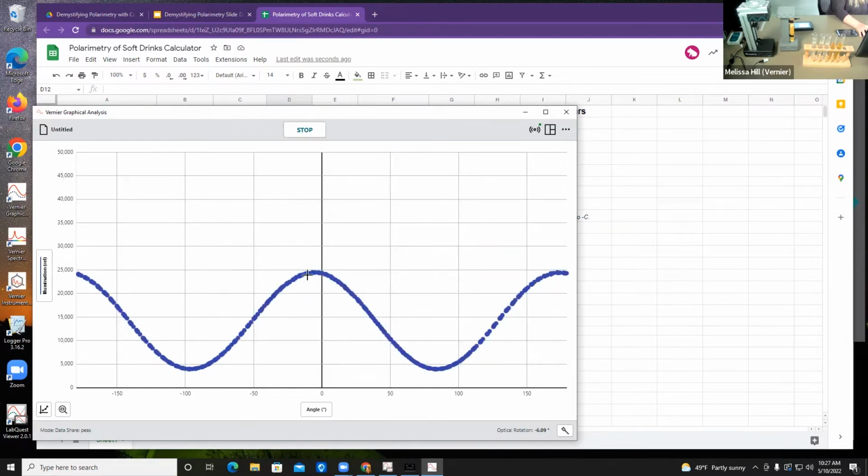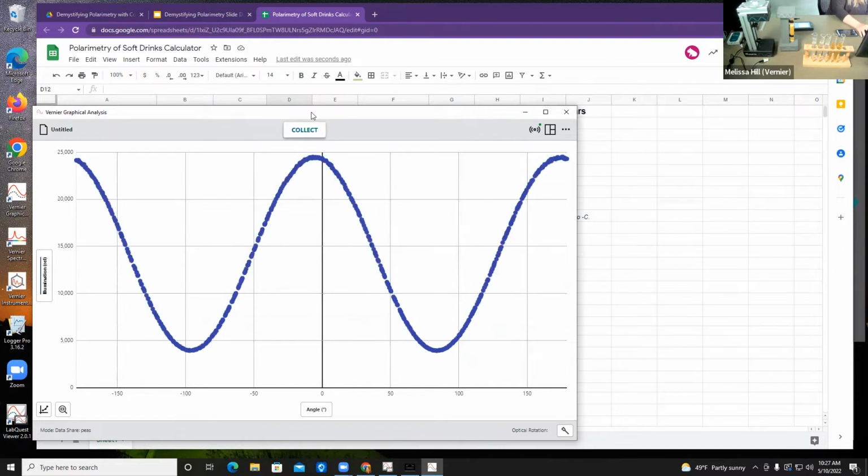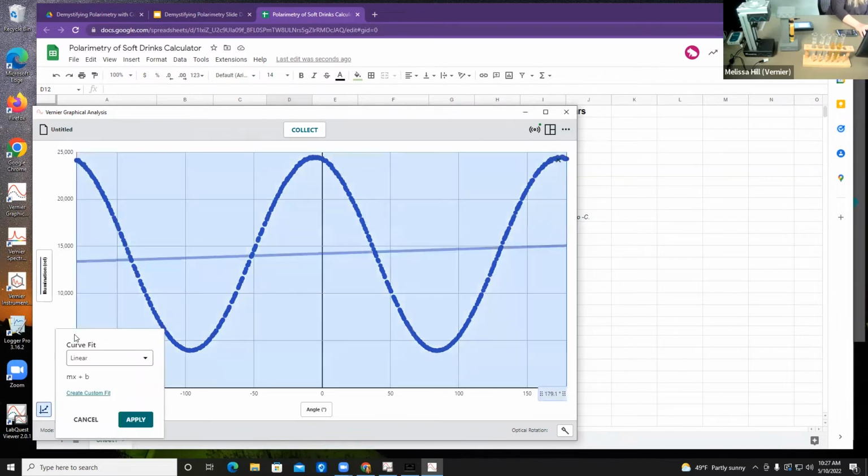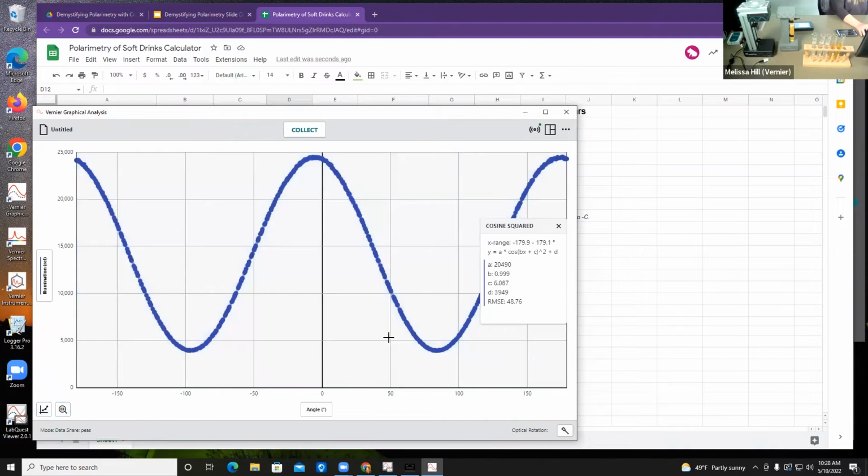And to me, that looks like it shifted a little bit negative. It's going to the left there. And so I'm going to guess that it's fructose. And then I can confirm that by looking at the label. And I think if you wanted to kind of conceal it from students, like, oh, here's a couple of different samples, pick the one that's the soda that has high fructose corn syrup in it. You could also frame it that way. But it is indeed shifted left.